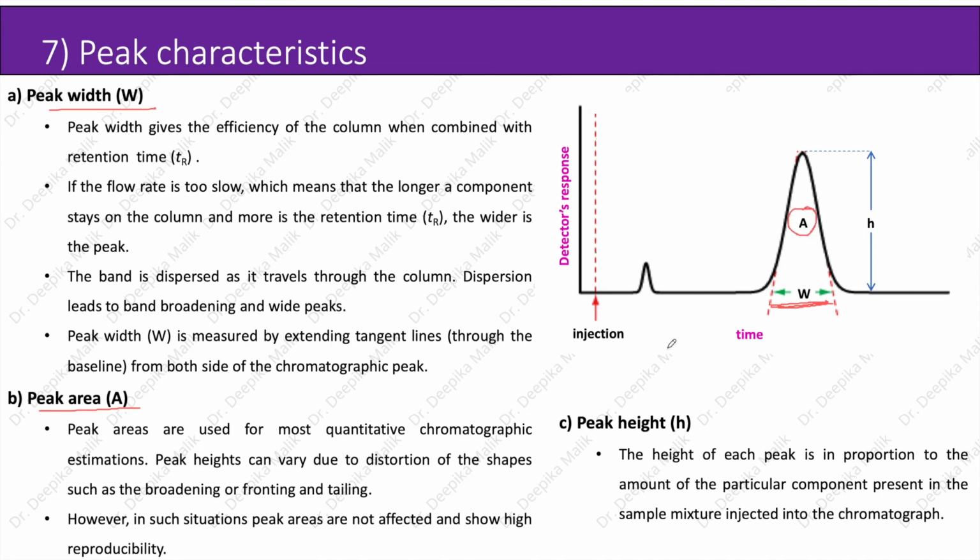Another parameter is the peak height. The height of each peak is in proportion to the amount of the particular component present in the sample mixture injected into the chromatograph, but as I told earlier, the peak height can vary and therefore peak area is a better option for quantitative measurement in chromatography technique.